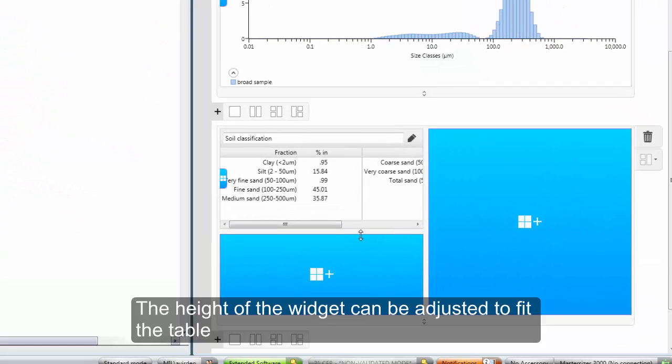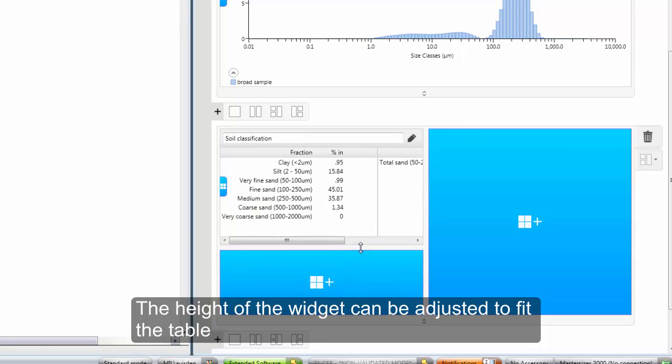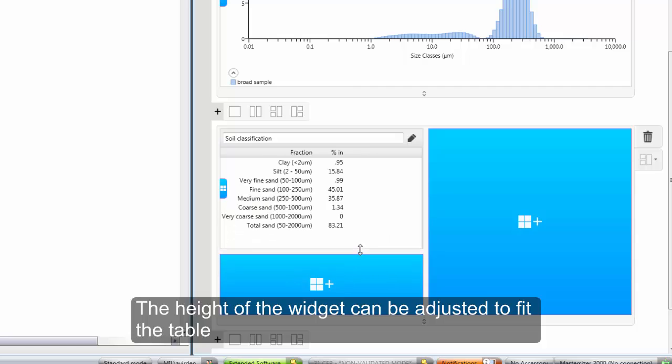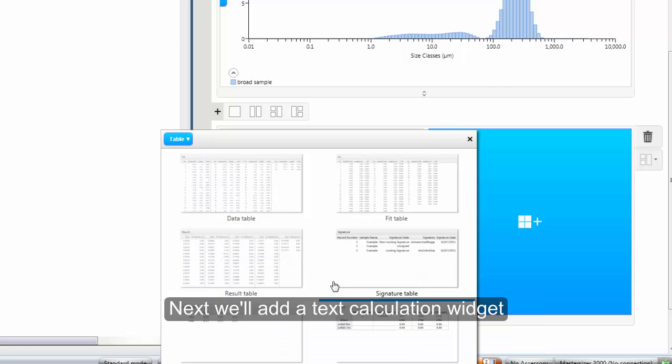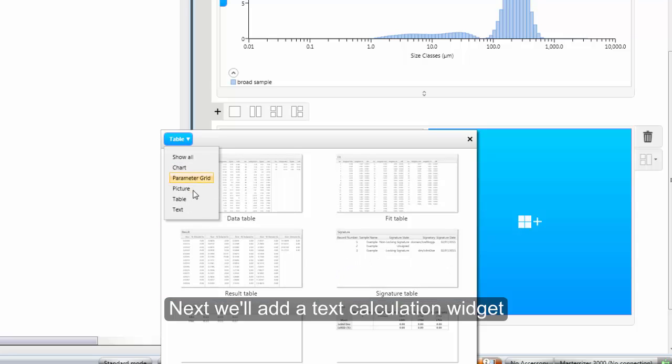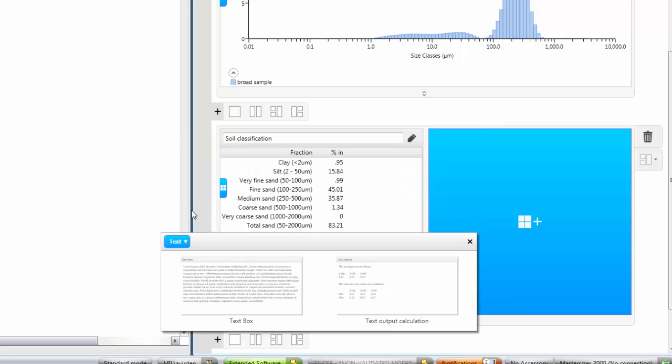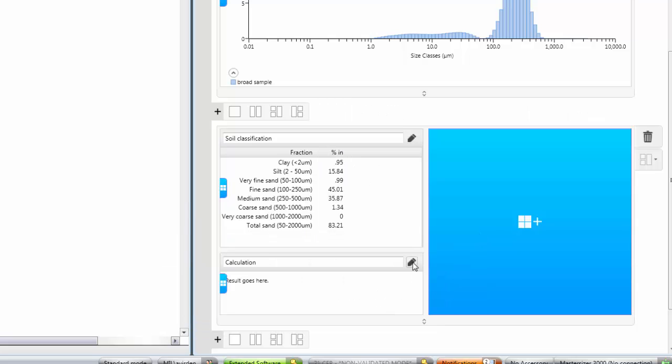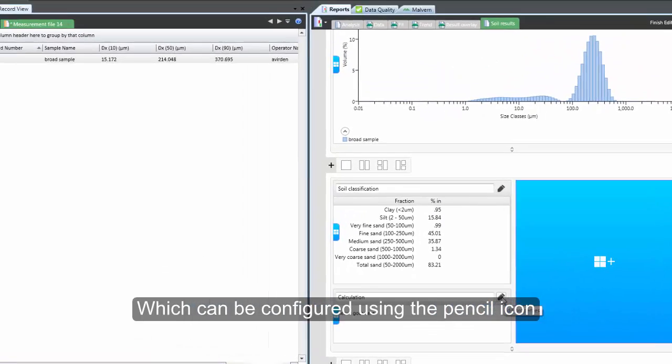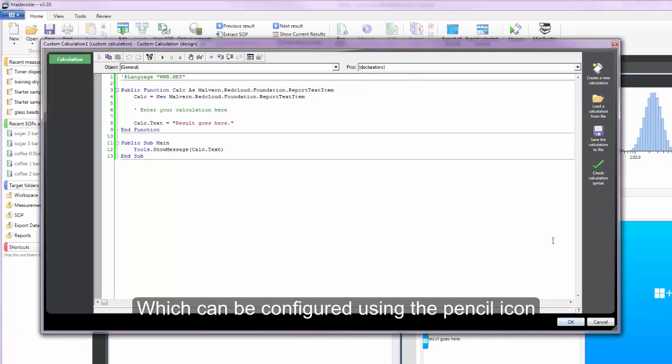I can then adjust the height of the widget so that the table fits nicely into the space. In the box below I want to add a text widget. So I will now filter for text and add a custom calculation widget. I can then load the pre-installed custom calculation for soil texture.